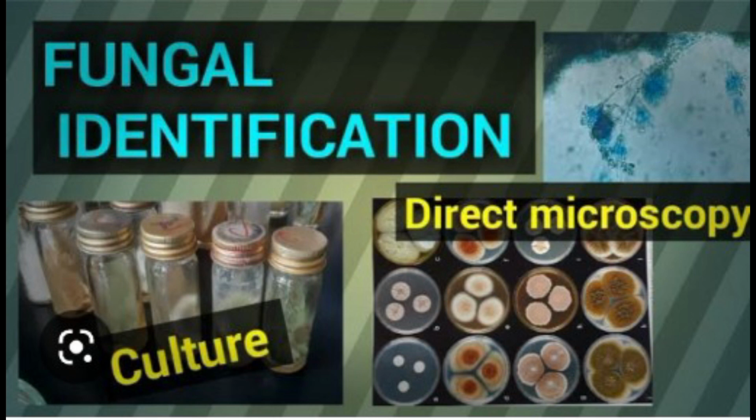Place the cover slip on the inoculated agar block. Moisten the filter paper in the petri dish with sterile distilled water. Incubate the slide culture at room temperature for 24 to 48 hours. Remove the slide culture from the petri dish. Dry the bottom of the slide with filter paper.